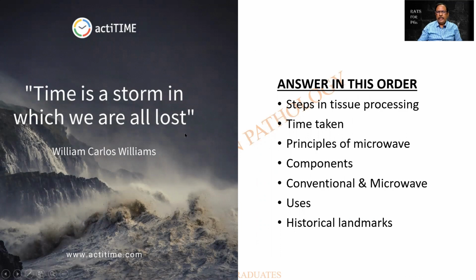So the main principle of microwave processing is time. And I hope you people answer all this. The steps in tissue processing, the time taken, what are the principles of the microwave, what are the components of the machine, differences between conventional and microwave, uses, and the historical landmarks.